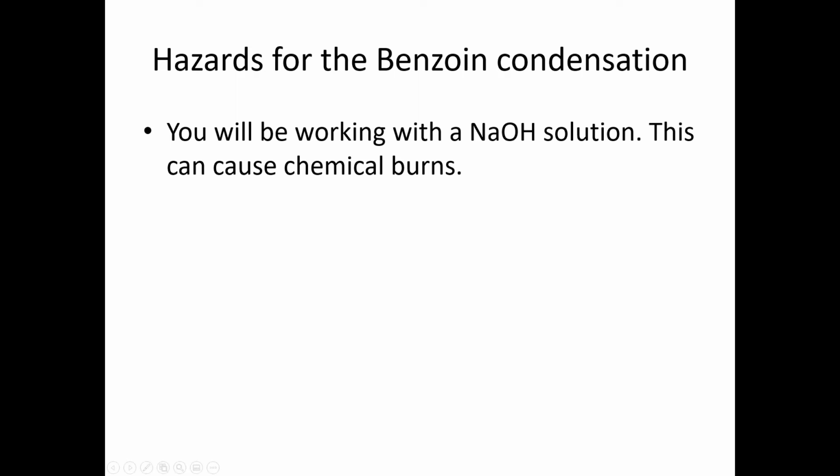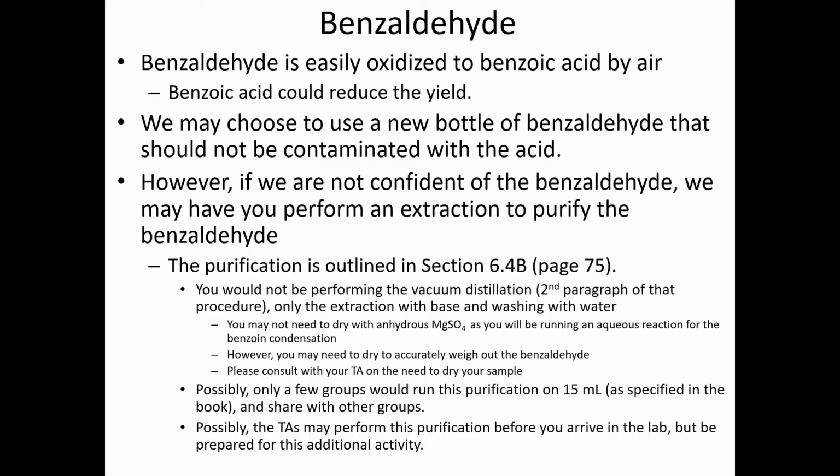So for the benzoin condensation, the major hazard that we'll be working with is sodium hydroxide. Remember, sodium hydroxide is a very strong base, so getting this on your skin can cause chemical burns. Something to remember from the very first lab is that benzaldehyde is very easily oxidized to benzoic acid.